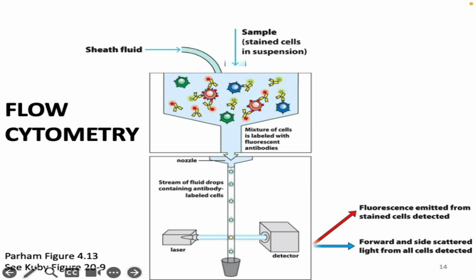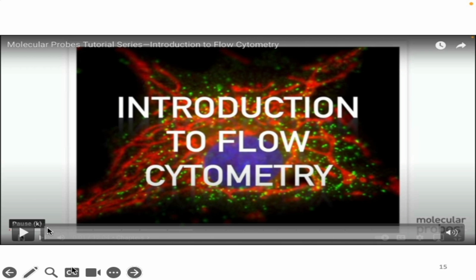And so I'm going to take the information that comes from that computer, and I'm going to use it to give me information about the cells. And again, this is where I can set it up so the speed of those droplets is letting me get 100,000 in 2 minutes, because it's going to go really fast and just shoot them with the laser. The computer is going to read out information about how that cell interacted with the laser light. We're going to move forward. So that's the sort of broad overview of cytometry. Let's see if this actually works.